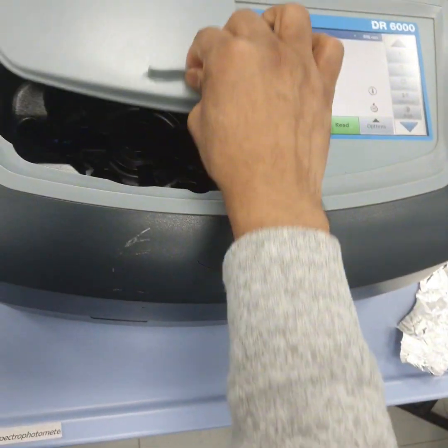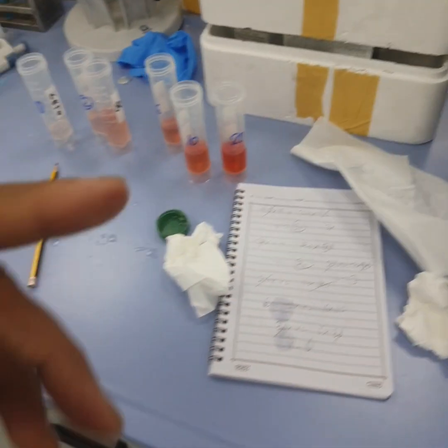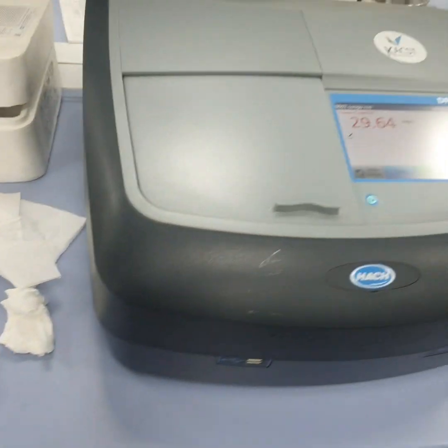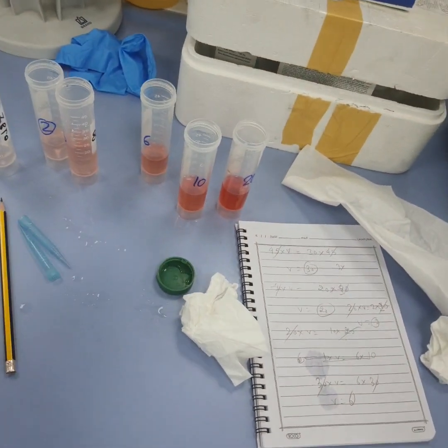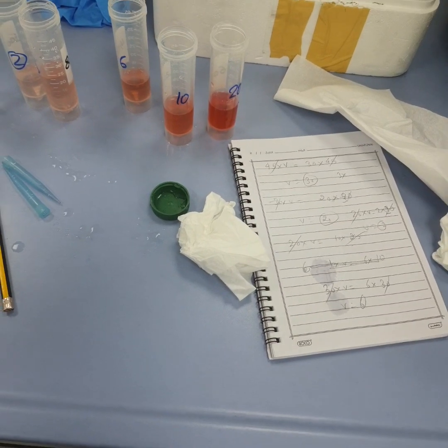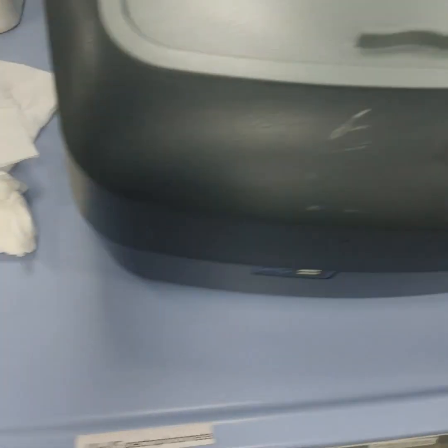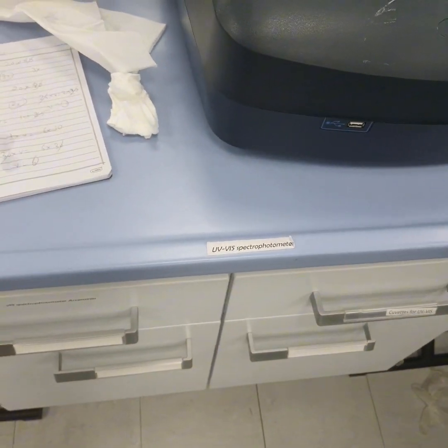So this was all about the calibration of the Congo Red, which is an anionic dye, using the UV visible. Now this has been done at neutral pH. Suppose you are changing the pH. In that case, the wavelength will shift. It won't be 496 since this is at pH 6, for example. Suppose you are doing your absorption studies at pH 8, pH 10, or pH 4 or pH 5. In that case, there would be a wavelength shift. The wavelength would not be the same. So in that case, you should make your calibration at all pH to minimize the error.